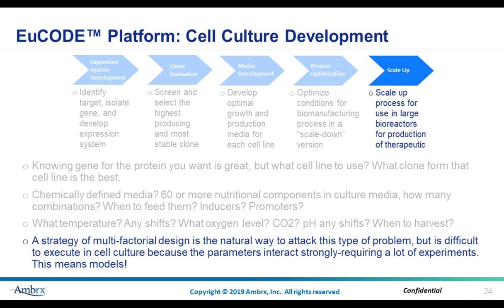In large-scale bioreactors, these parameters need to be selected carefully, as agitation-related shear force, for example, impeller tip speed, and aeration-related CO2 accumulation may increase with scale. A qualified cell culture scale-down model is very crucial. It can provide the necessary information to assess and resolve any unexpected performance problem of the large-scale system.